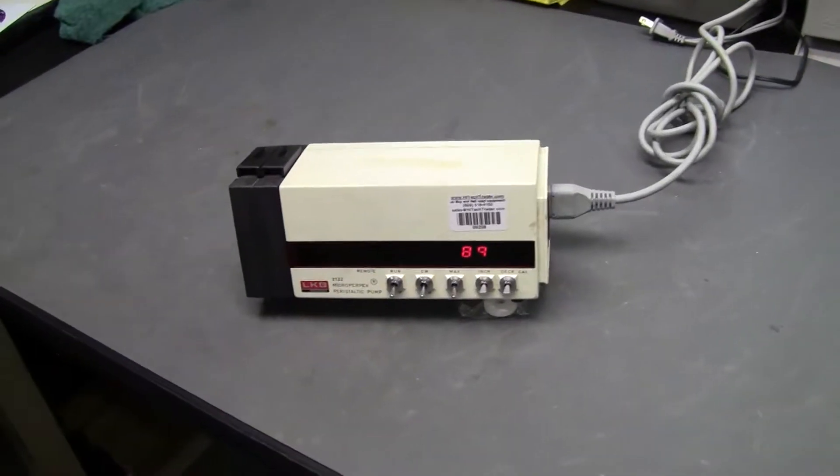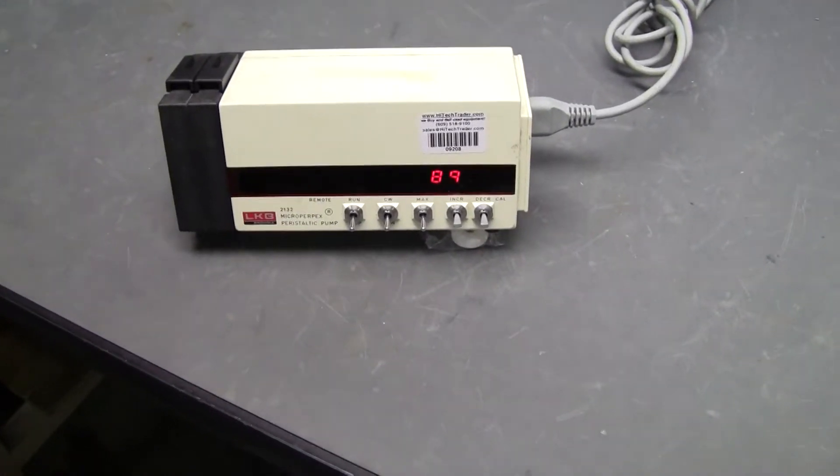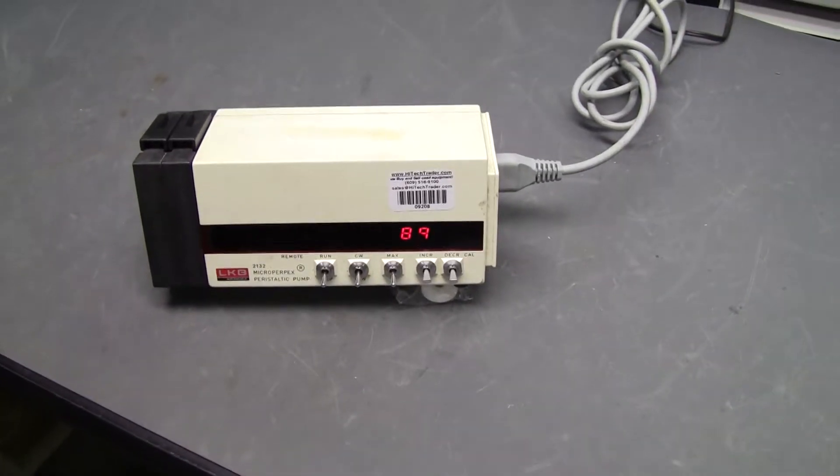Hi, this is Michael Natale from Hitech Trader. Today we're looking at the LKB Micro Peristaltic Pump.